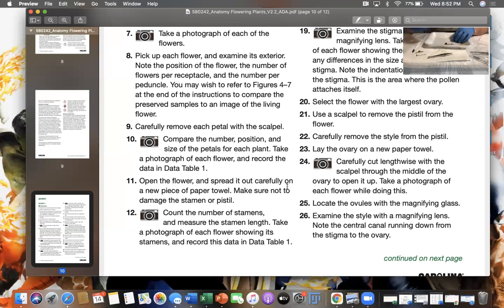Okay, now the challenging aspect, the milkweed. It seems like the inner flowers are really connected to the stamens. So I'm not going to cut those because I don't want to cut off all the stamens. And white on white is very hard to discern.